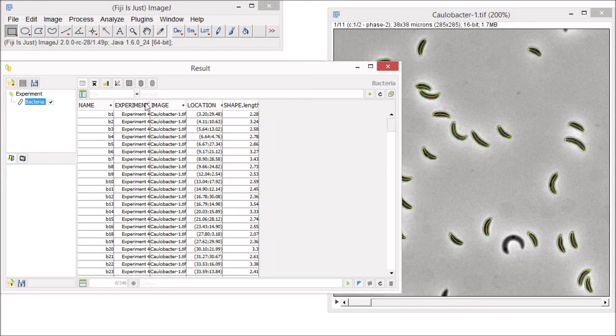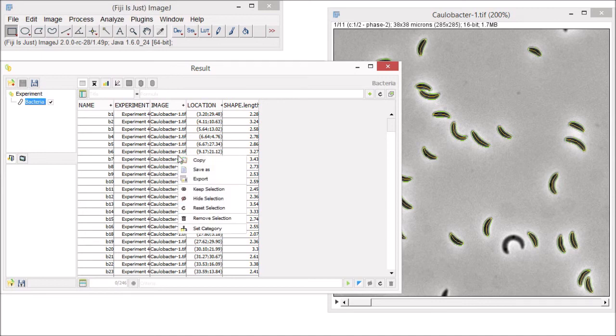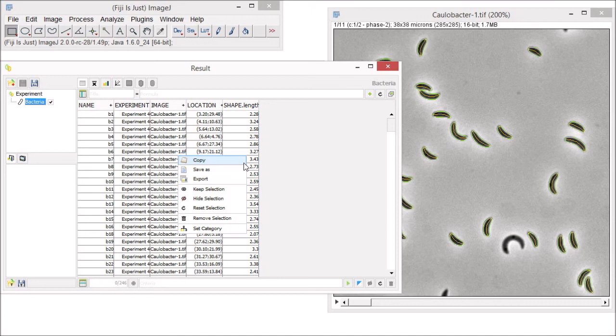Once you've revealed the data that you want to analyze further, you have several options. At any time, you can right-mouse-click or control-click anywhere on the list and copy the active data set to the clipboard to paste it into your favorite statistics or graphing software tool, or save it as a file.